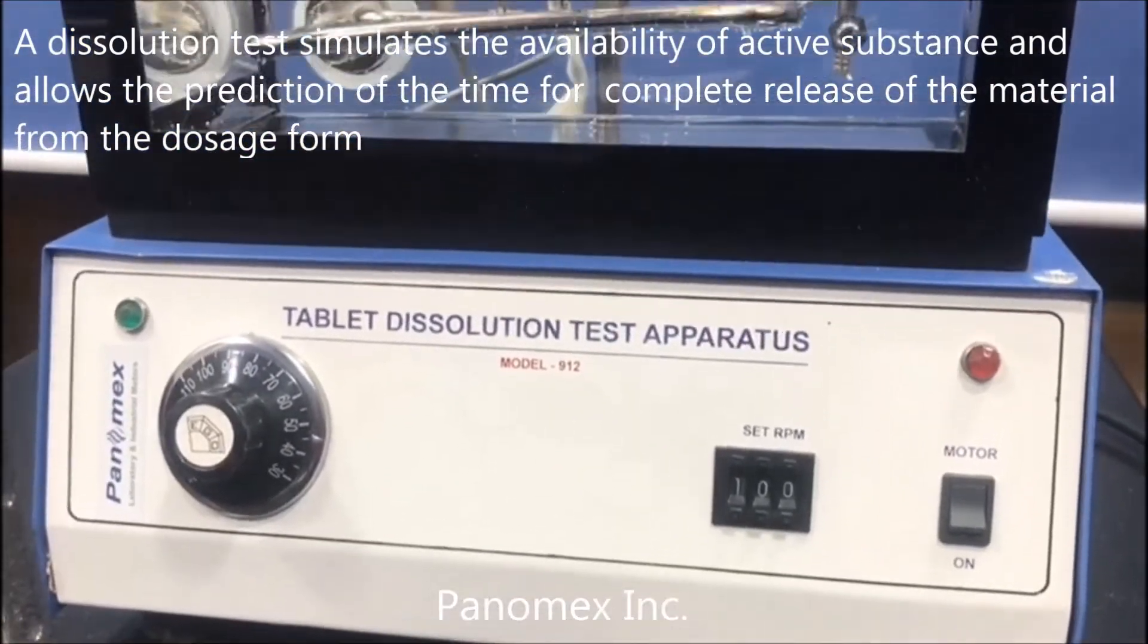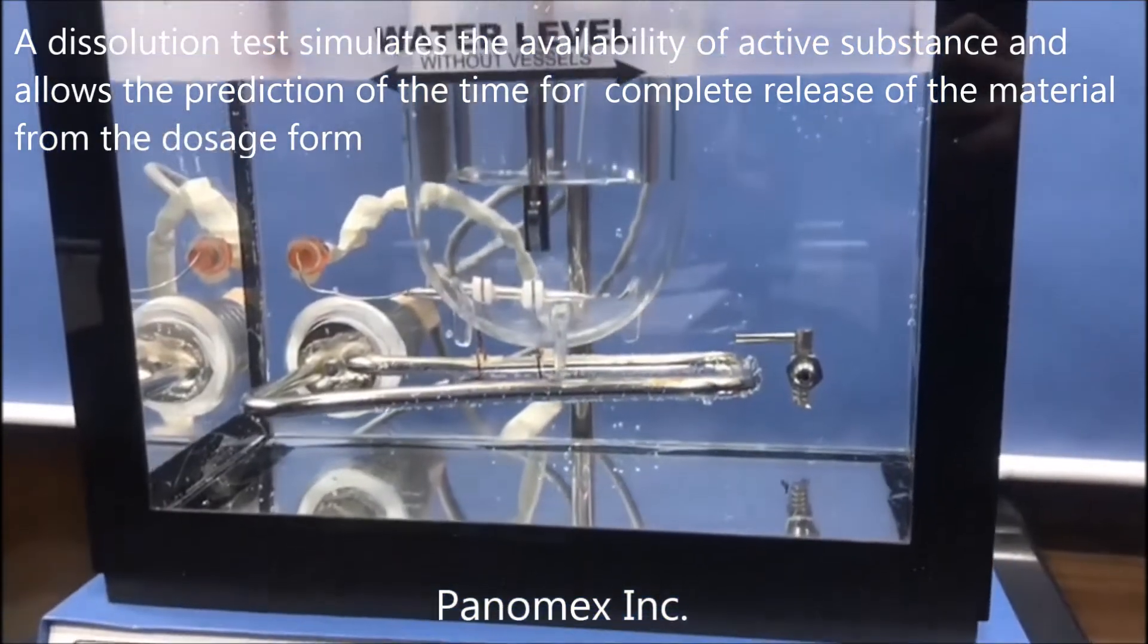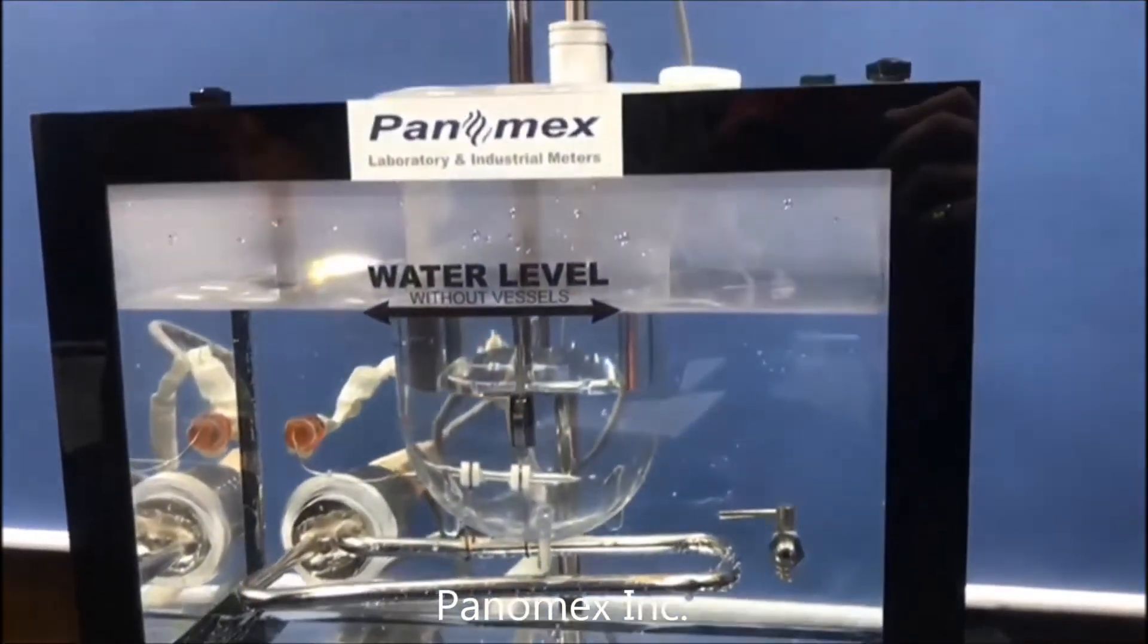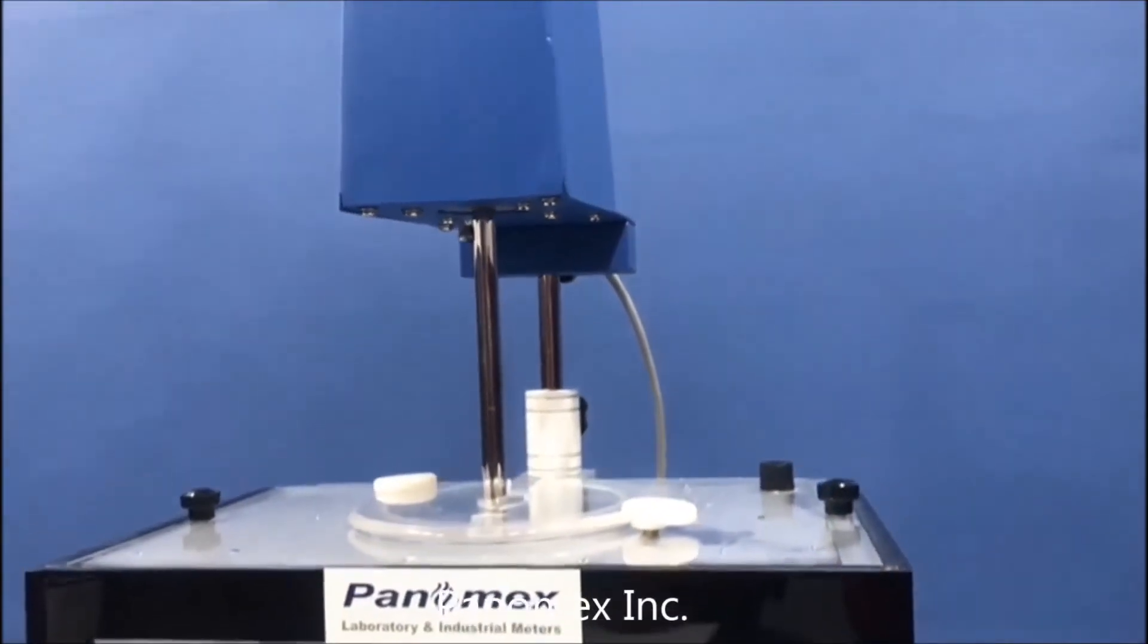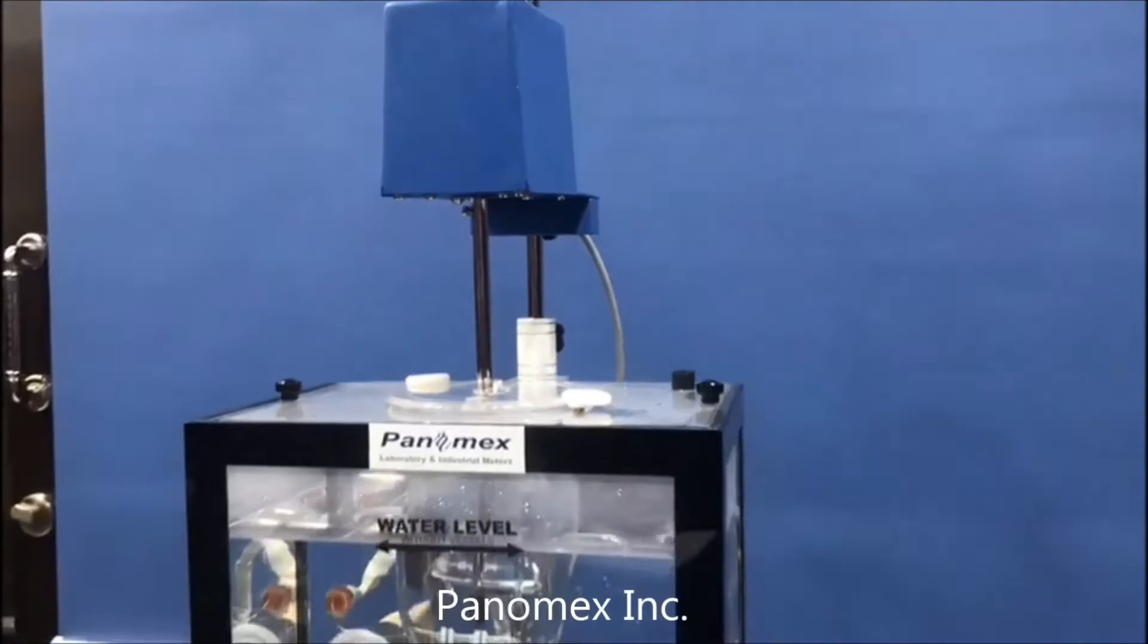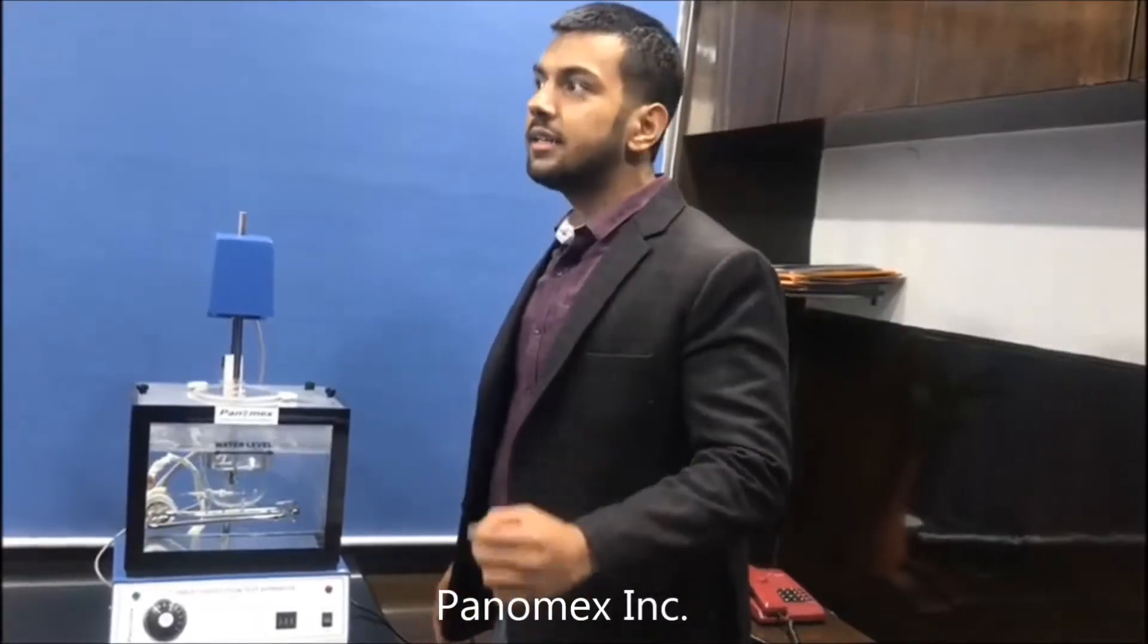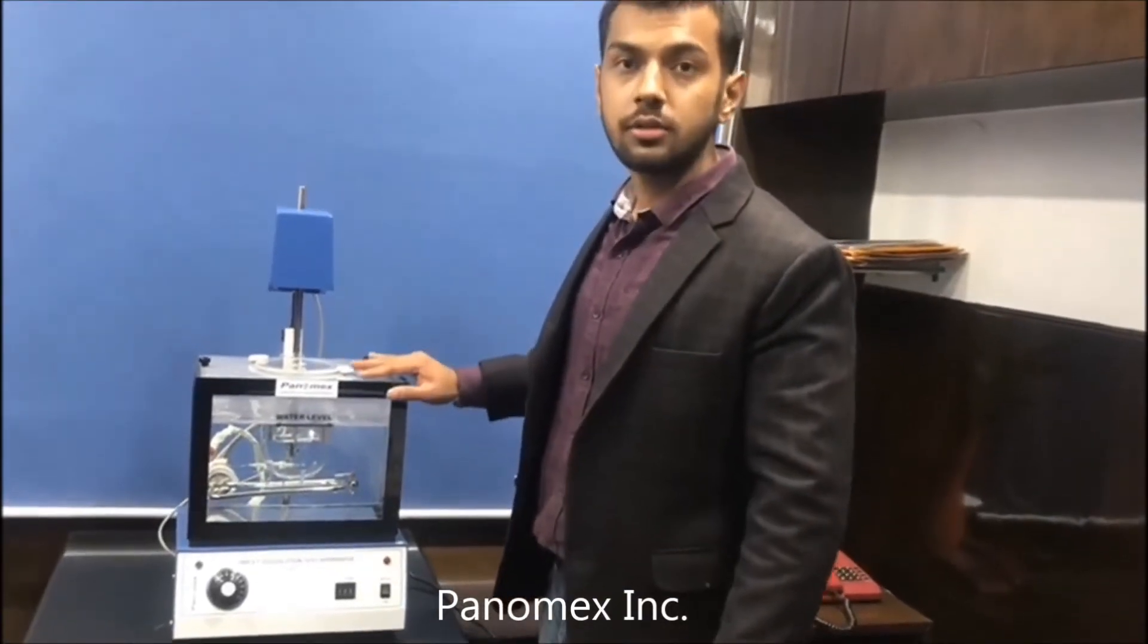This apparatus evaluates adequate bioavailability and provides necessary information to formulate and develop more efficacious and optimum dosage forms. Let's get started. Now I'll tell you how this machine actually works.